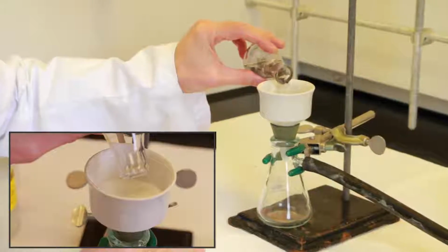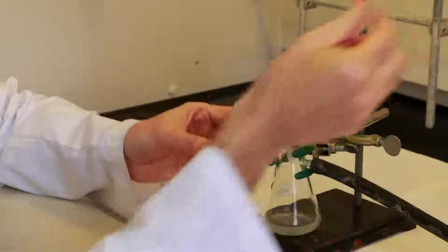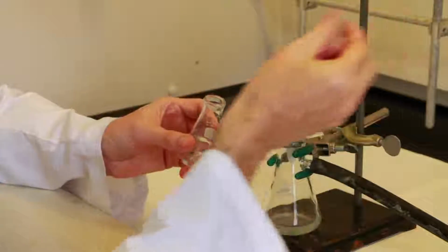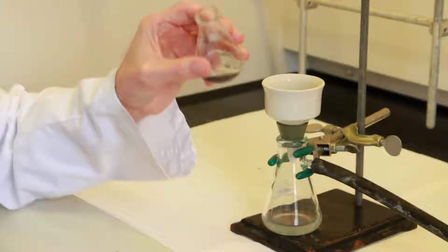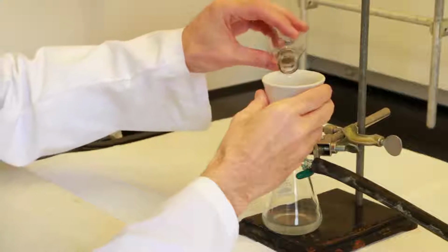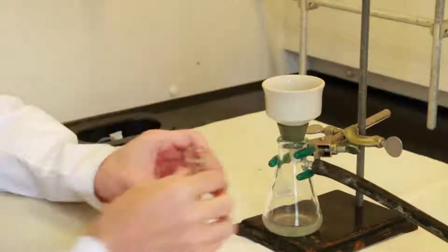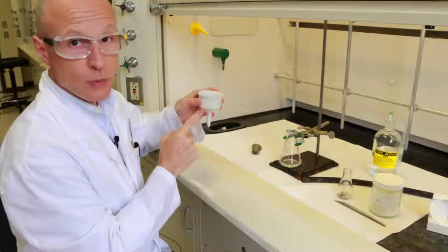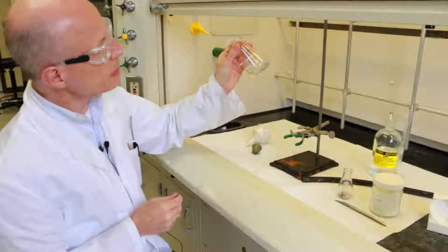And then you can filter as usual. You may want to rinse your flask with some of the solvent and rinse the Celite as well to make sure that none of the product is trapped in the Celite bed. And then you add that solvent to your solution. So this will become waste, and what you are interested in is the clear solution at the bottom of the filtering flask.